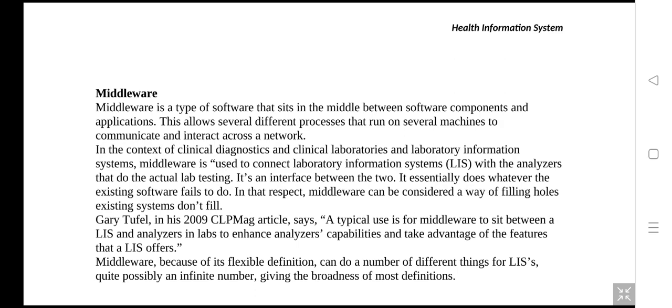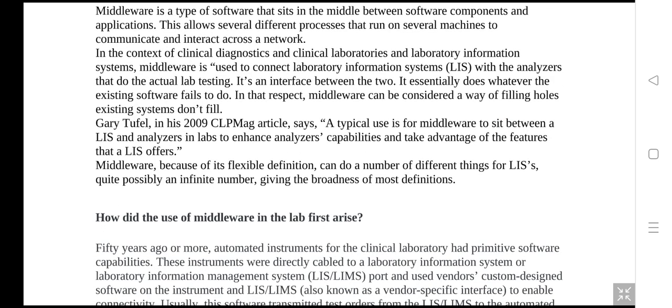So we're talking about a component and an application. We're talking about the link between an equipment and our LIS, in the context of clinical diagnosis and the clinical laboratories: the laboratory information system with analyzers that do the actual lab testing.